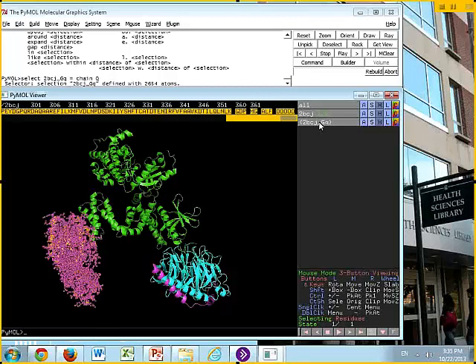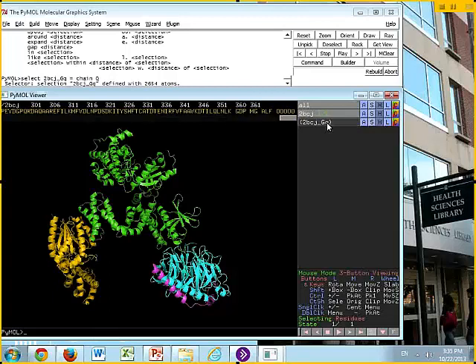Now, if you have 2BCJ_GQ turned on, you'll see these residues are already highlighted. You see them there? Now, we can actually turn them off or turn them on. We're editing 2BCJ_GQ. We actually don't need to worry about this selection. I want you to turn off the highlighting for 2BCJ_GQ.